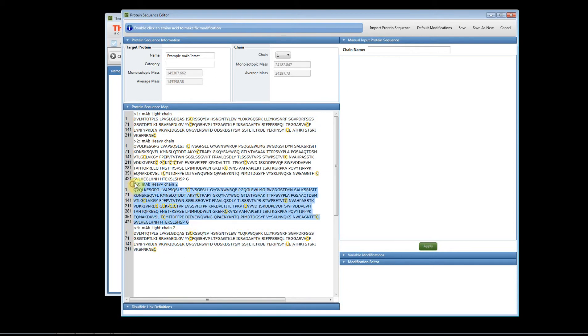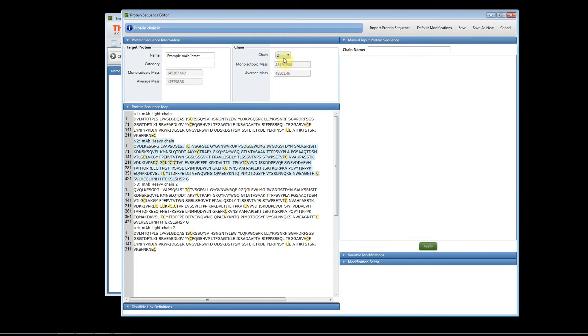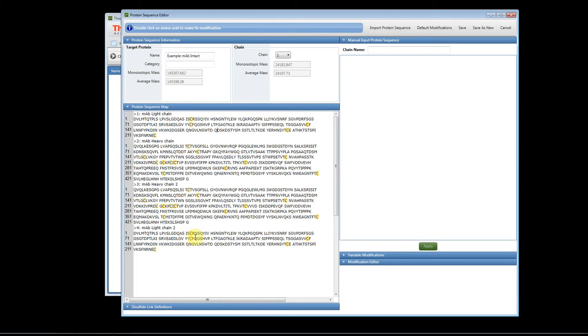We have heavy chain two and we have heavy chain one. The molecular weight should match what you predict the molecular weight for the intact antibody to be. You can see the different masses of the individual chains by clicking here, but if you're doing an intact analysis you must bring in multiple copies of the chain.